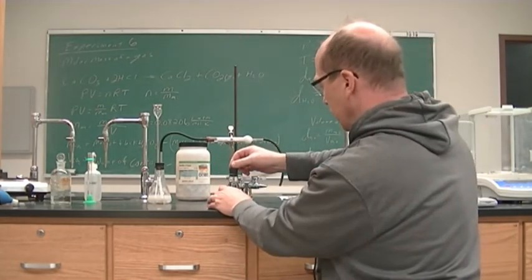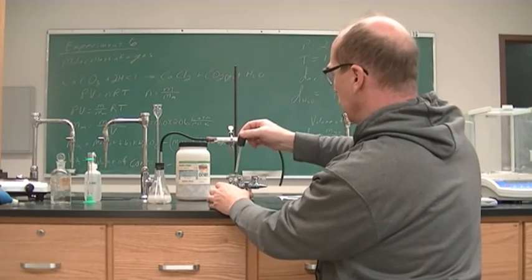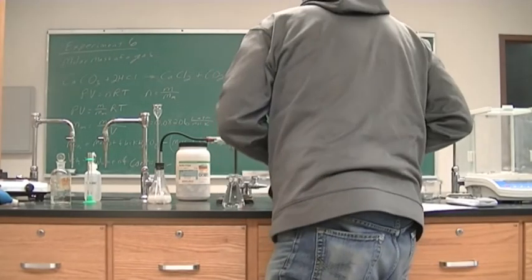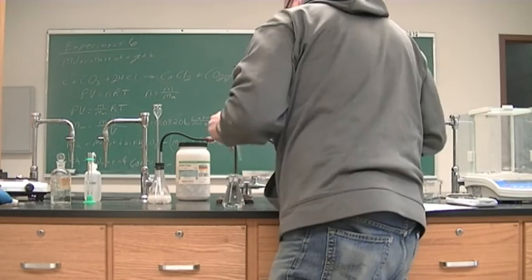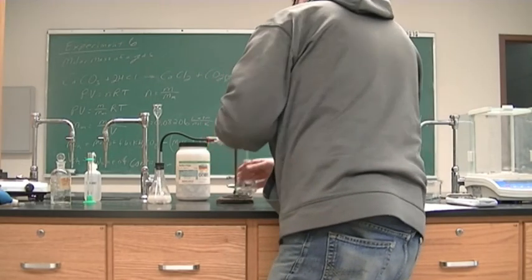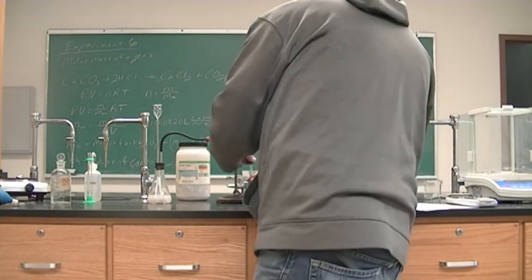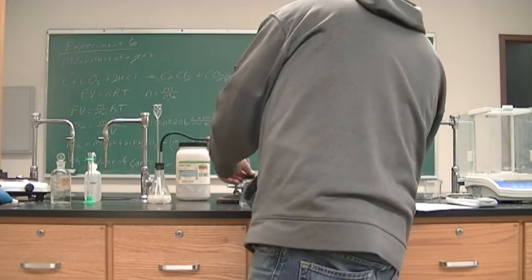And then when I put this in, that's too much water. I'm going to need some towels to wipe the outside. CO2 doesn't stick to the outside. Water will stick to the outside.